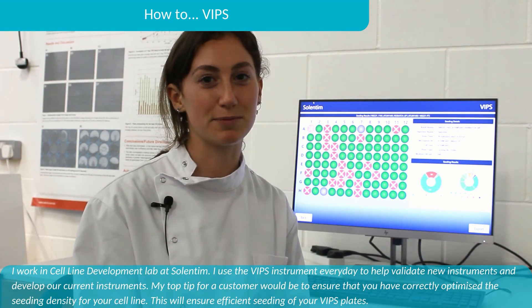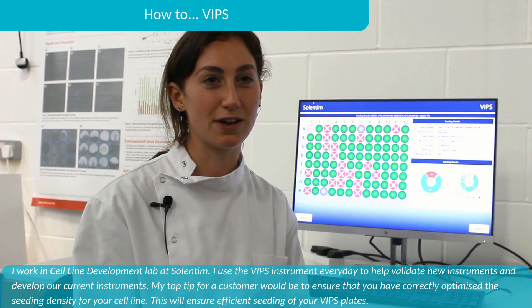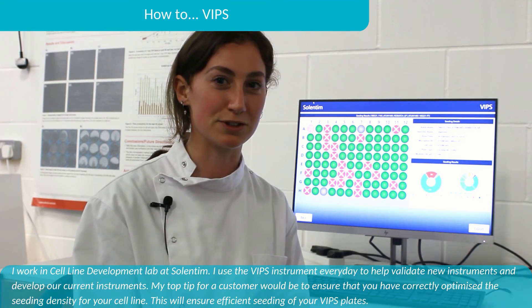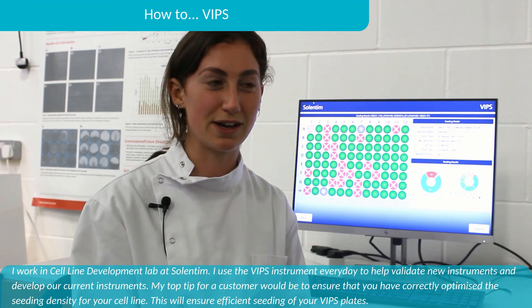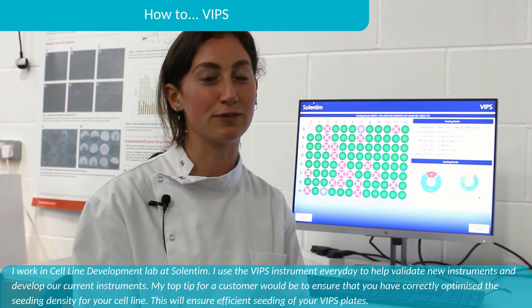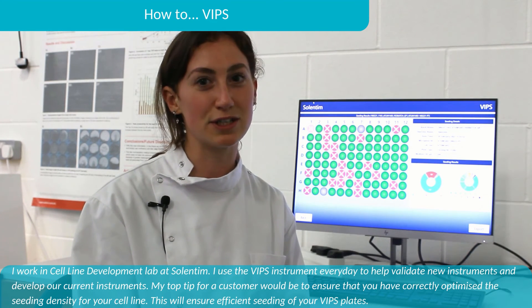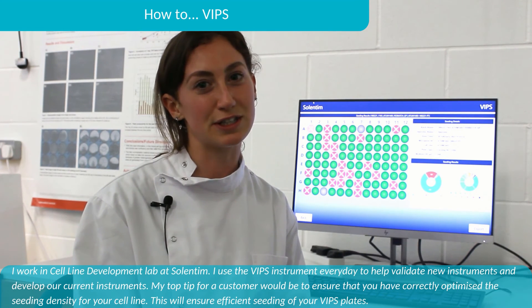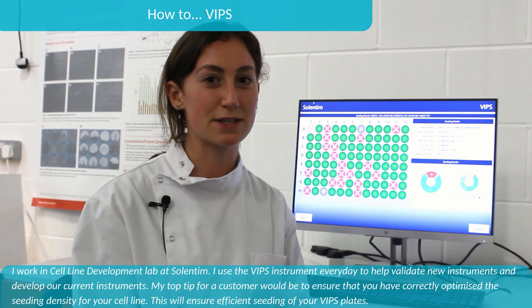I work in the cell line development lab at Solentim. I use the VIPS instrument every day to help validate new instruments and develop our current instruments. My top tip for customers would be to ensure that you have correctly optimised the seeding density for your cell line — this will ensure efficient seeding of your VIPS plates.